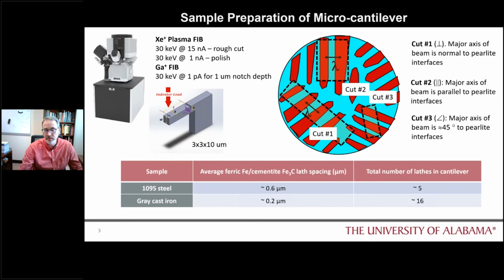Now, if we go to the cryogenic temperature, in this case, we were actually able to get down to minus 160 C, even though it's spec'd out at minus 150 C. In this case, we were able to go about 10 degrees lower. And here our laths in this example are at an angle of about 45 degrees to our notch. And then in these cases, we again see this load and then relative flat behavior.